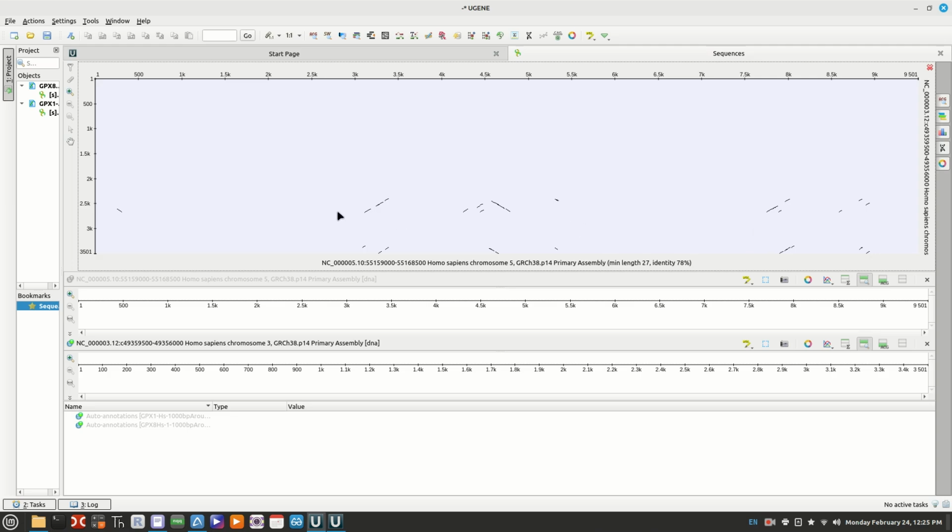So there is an explanation for this, but I would like you to also turn on the inverted repeats and indicate if you see something like this indicating duplication, and you probably should. It is along the pieces. If you'll notice here, on one strand or the other, these are duplicated and these are duplicated. It's duplicated in both genes.